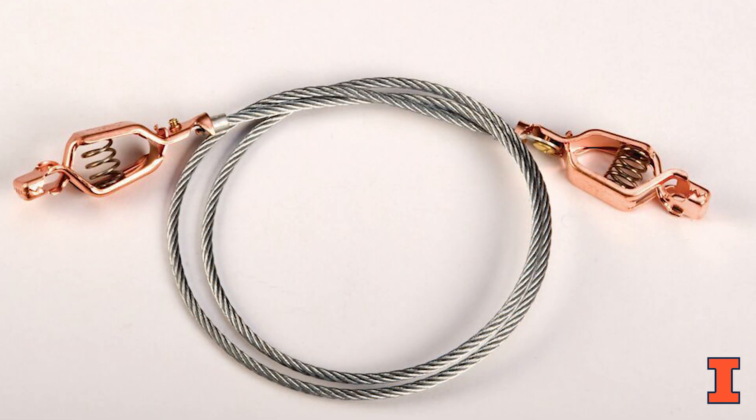This can be achieved using an electrically conductive bonding cable as shown. Braided wires are a good choice since they offer robust strength and dependability when frequently connected and disconnected.